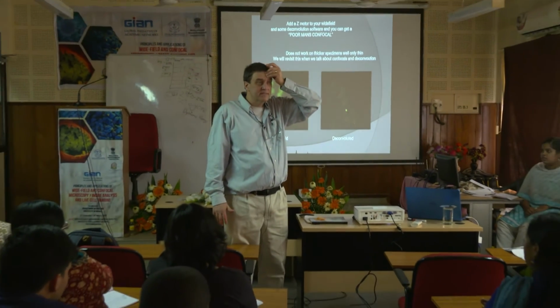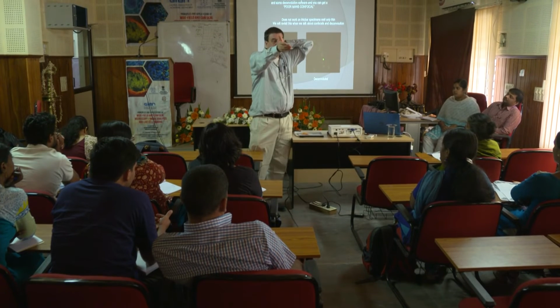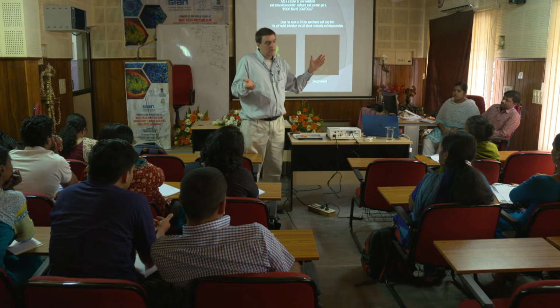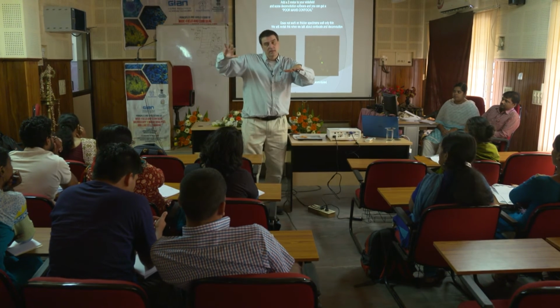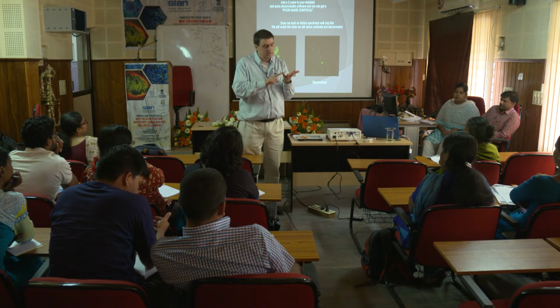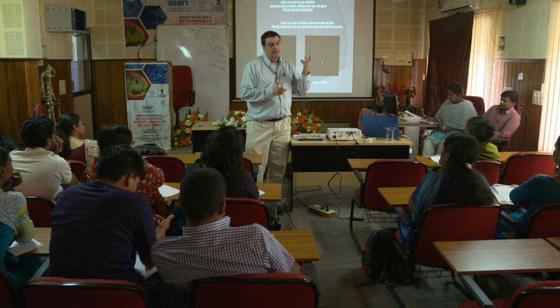The other thing is, like somebody said today, autofluorescence is a background feature too, of just the tissue naturally. You have no dye on it or anything, but it fluoresces. So in a situation like that, you might want to work with dyes that are more out in the red to try to avoid that autofluorescent background. Because the major backgrounds I see are autofluorescence and then non-specific secondary antibody staining, which we'll talk about.